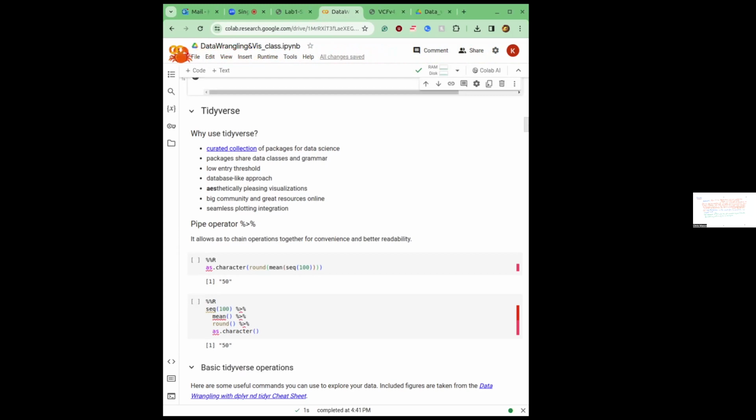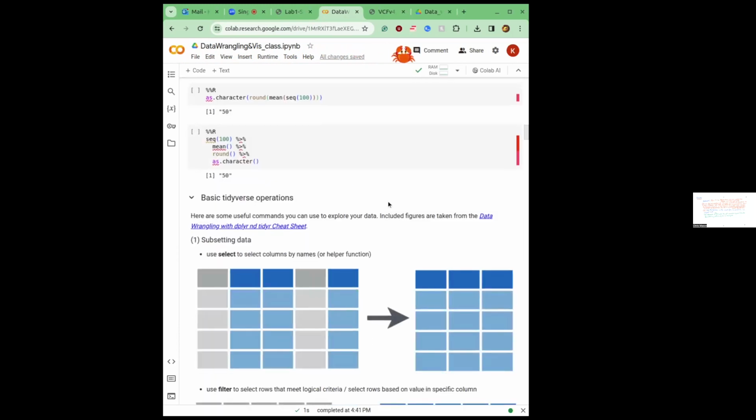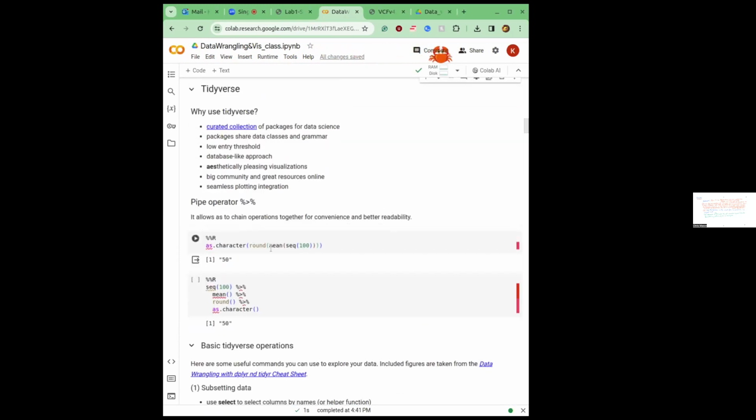And we'll go through, I think, the most important operations in my opinion, and look at them in a moment. What is very nice is that one of the packages that are part of tidyverse is ggplot. So you can just pipe it right through to the ggplot function and continue. So it's very cool. So yeah, this is basically how it works.